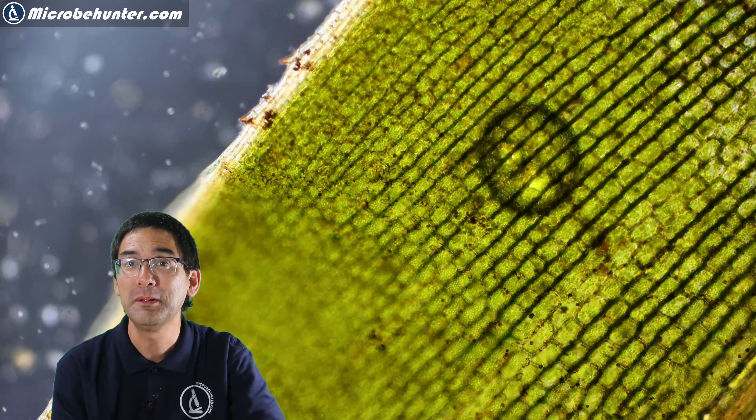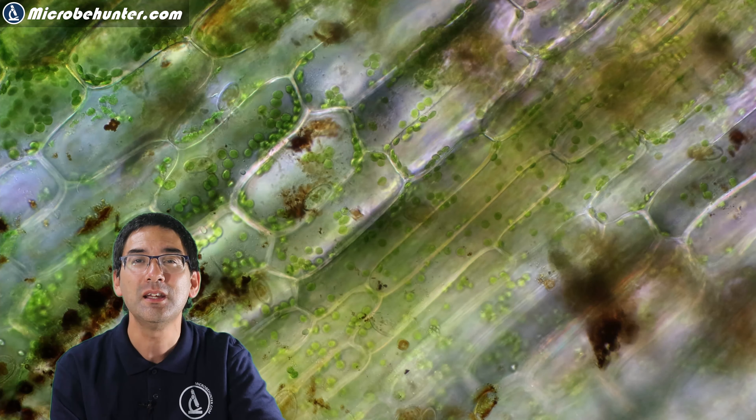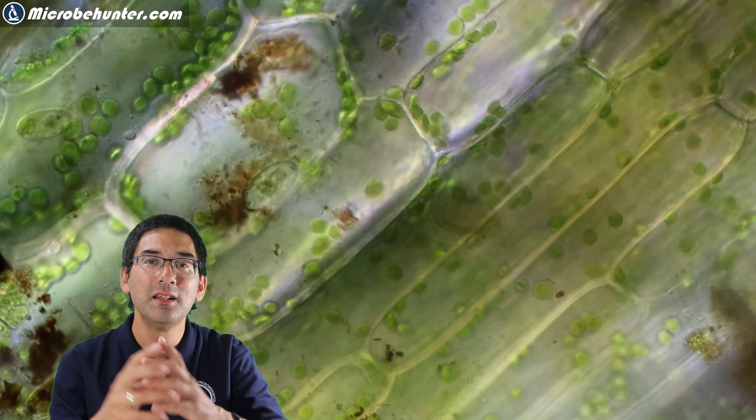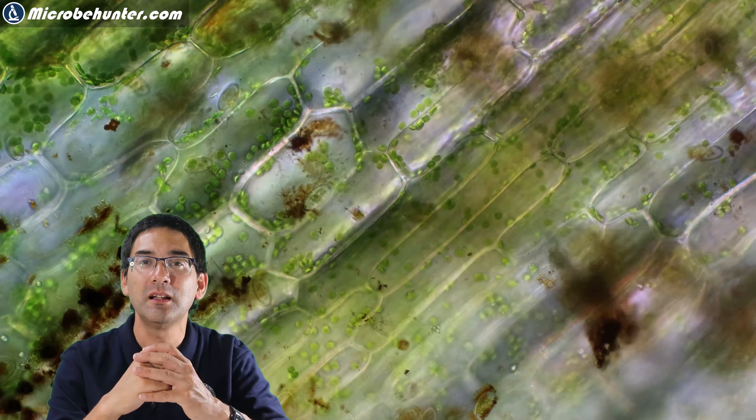You have to go up with the magnification a little bit. The leaf is relatively thin so it allows light to go through quite well. At higher magnification you can also see there seems to be something growing on the leaf — possibly diatoms that have attached themselves to the surface. But what is really interesting here are the chloroplasts. Going all the way up to approximately 400 times total magnification, we can already see the moving chloroplasts quite well, and if you look at a less densely packed area, you can see the chloroplasts moving around the cell in a circle. There seems to be a central vacuole in the cell, and the cytoplasm is streaming and pulling those chloroplasts along.